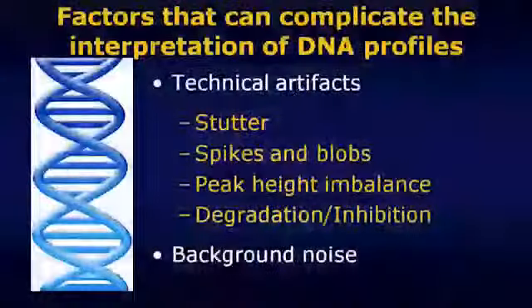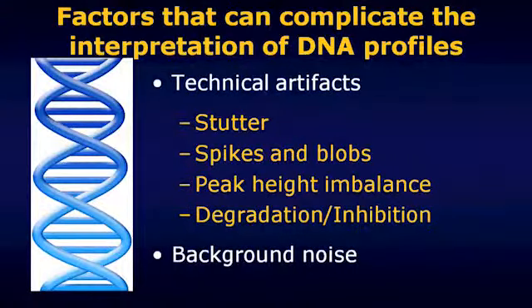And I'm not alone in thinking that. A number of laboratories have made that switch over the past few years. Hopefully more will soon as well. So where have we been during the course of this video? Well, again, this video was all about talking about factors that can make interpreting DNA profile evidence, electropherograms, a little bit more complicated than you might have thought if you had only cut your teeth looking at reference samples. These are the sorts of things that come up time and again when we're talking about issues that make interpreting evidence samples a little bit more complicated.